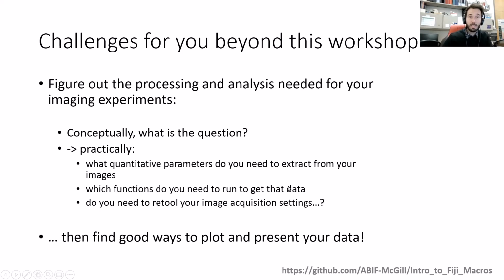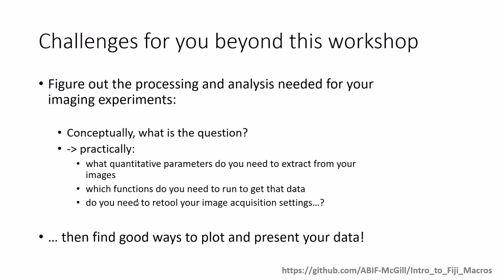Which functions do you need, especially in Fiji? And then do you actually need to retool or rethink your acquisition settings to be able to get the information that you need? And then afterwards, it'll be up to you to figure out how to process all that data. Today, we're just going to generate a bunch of tables. So it's up to you to figure out how to use Excel or R or Python to plot your data or get that data into a visualizable form. So we'll go with that.